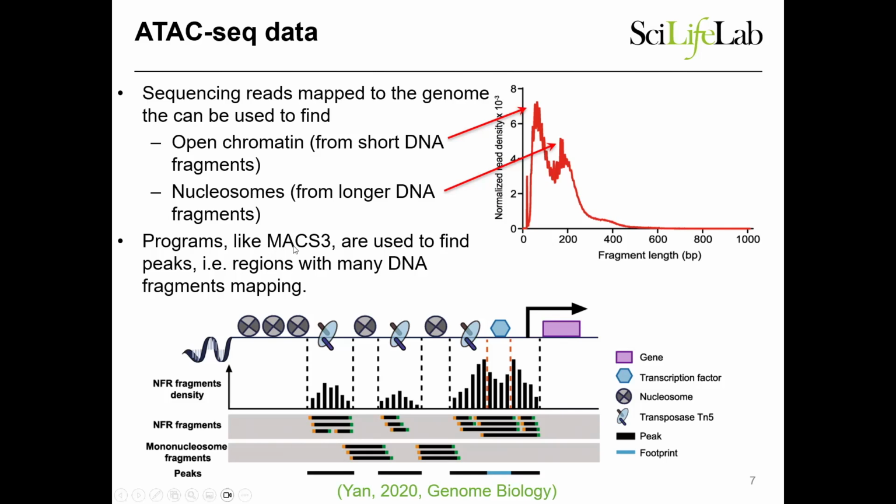One is called MACS3, but there are many. This is a very old area in bioinformatics. Many years ago, people wrote a lot of these programs, and there are a lot of them out there. But yeah, MACS3 is one of the most commonly used.